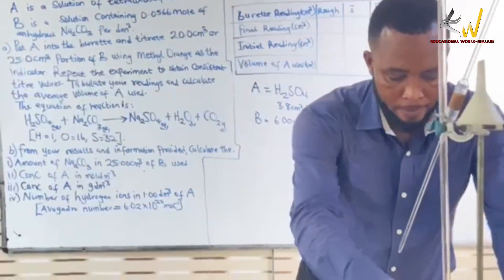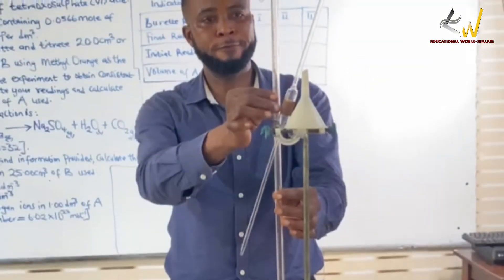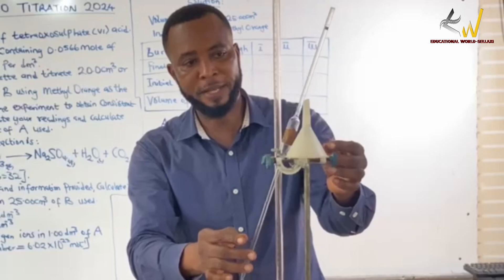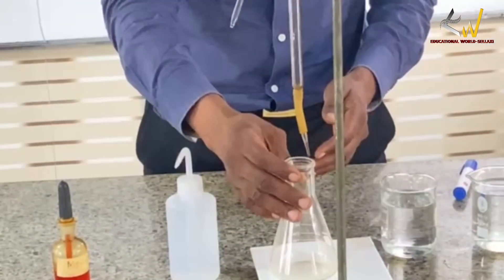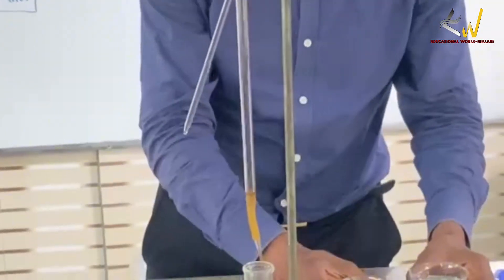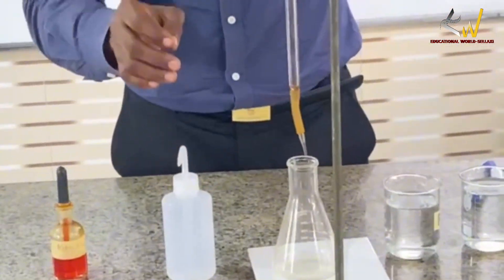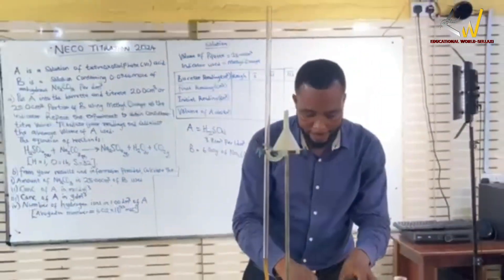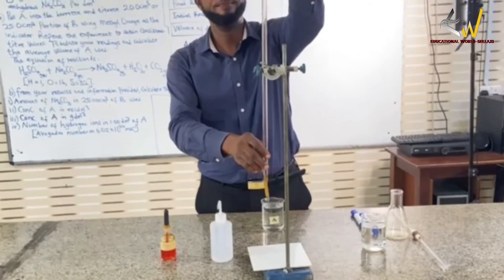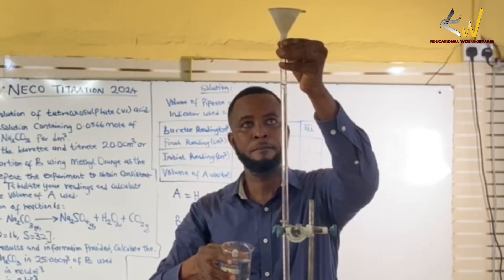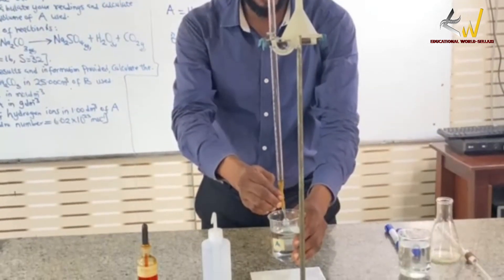Now with me here in my titration setup, these are the apparatus we have. We have the burette with its stand and clamp, the white tile, the conical flask, and the funnel. Solution A and solution B are here, along with the distilled water and my indicator to show the color change. I'll fill the burette with solution A using my funnel, and zero it to 0.00 cm³.